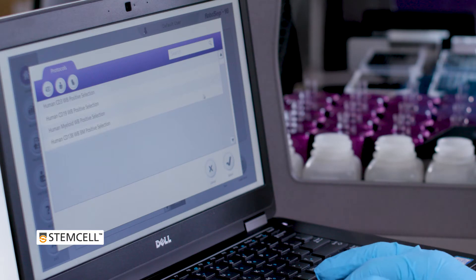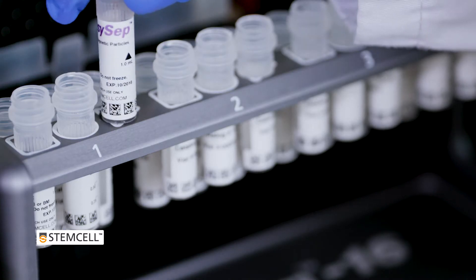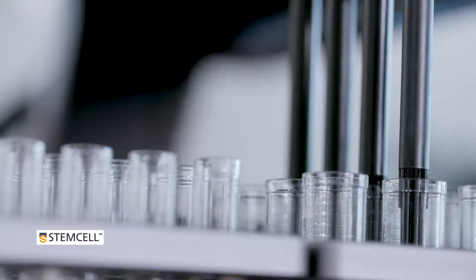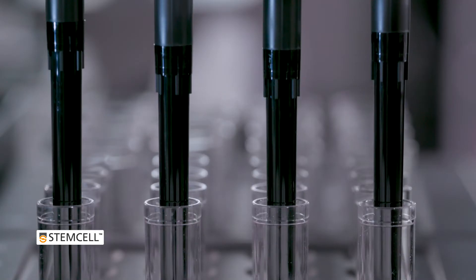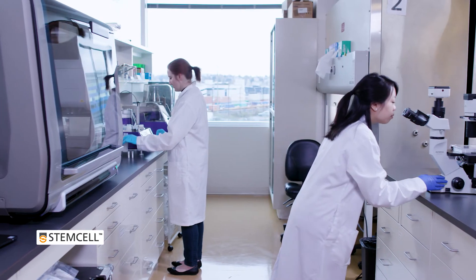Starting the isolation process is as easy as choosing the desired protocols, loading the samples and EasySep reagents, and selecting Run. The RoboCEP-16 performs all reagent addition and sample handling steps, allowing users to focus on other laboratory tasks.